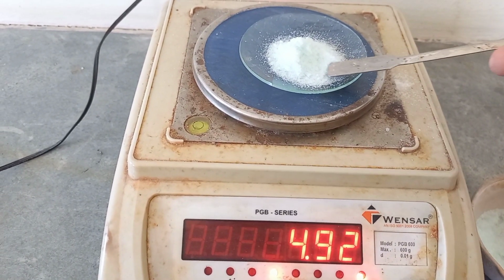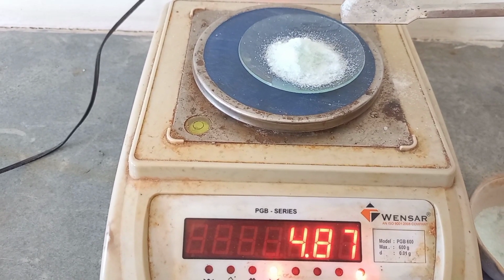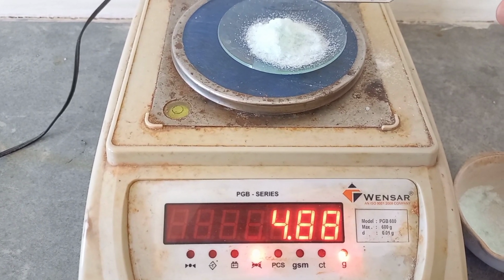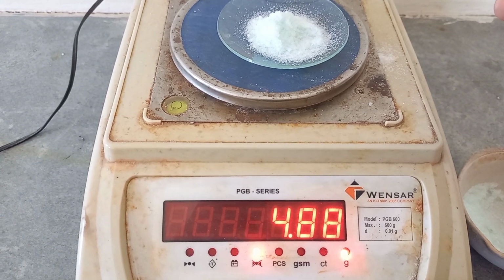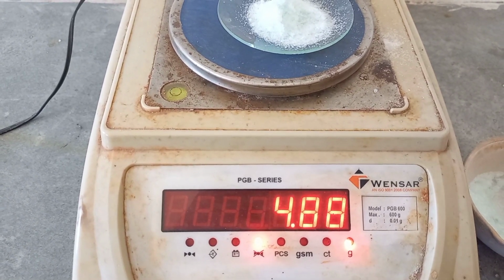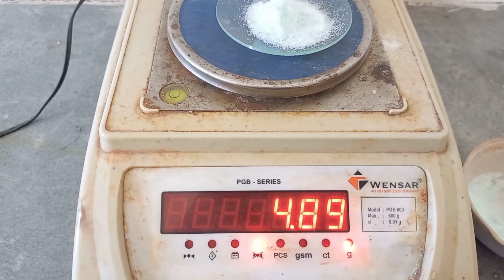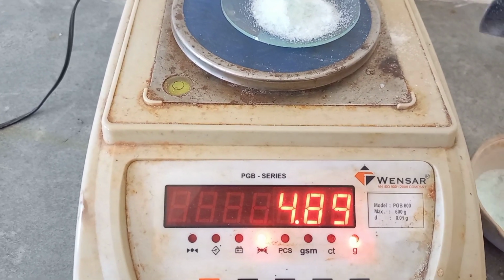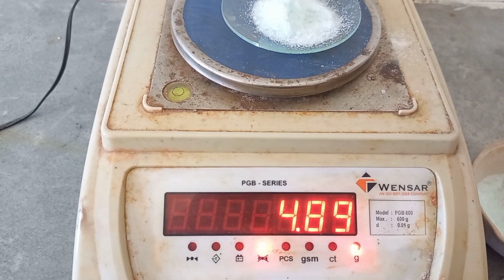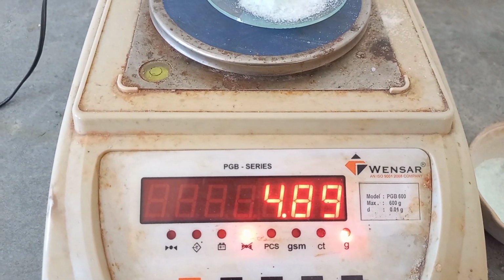Students, see, while measuring this salt, I am taking the precaution that we get the exact amount required for our titration. You have to wait a little bit, and you will observe that it comes exactly to 4.90. As soon as you get the value 4.90, we can start with our practical, preparing our standard solution.